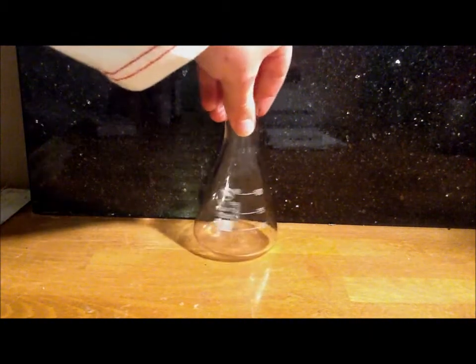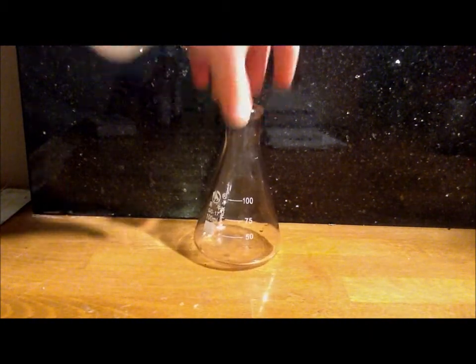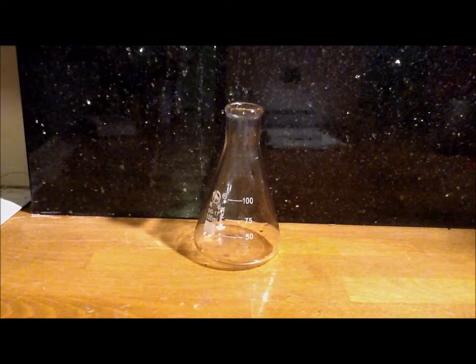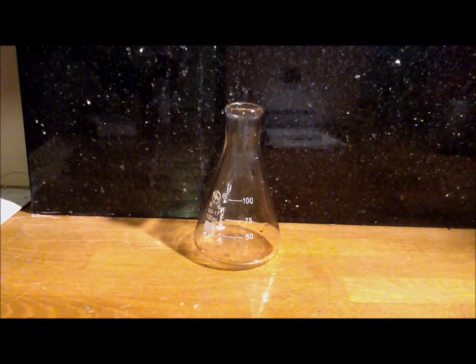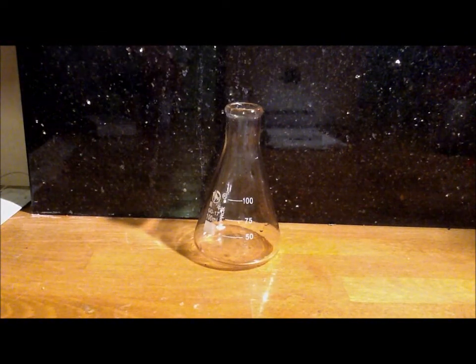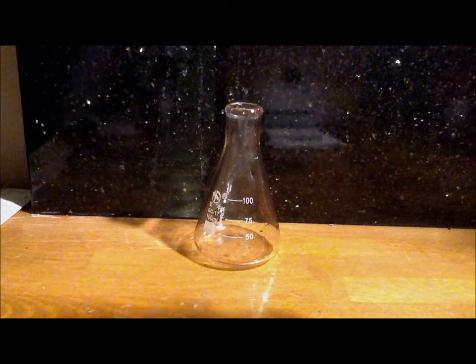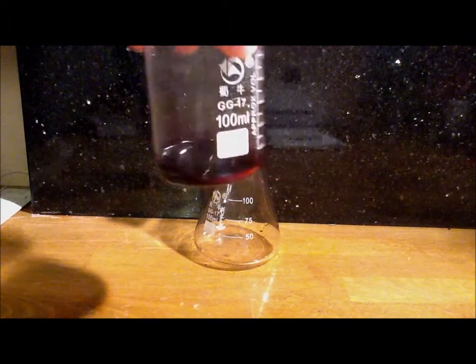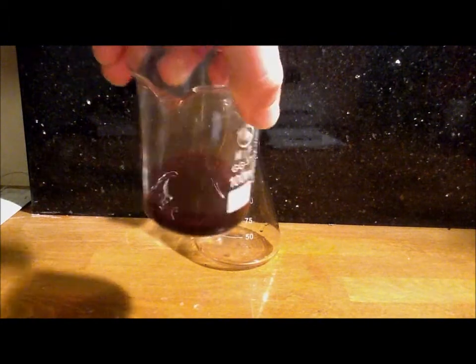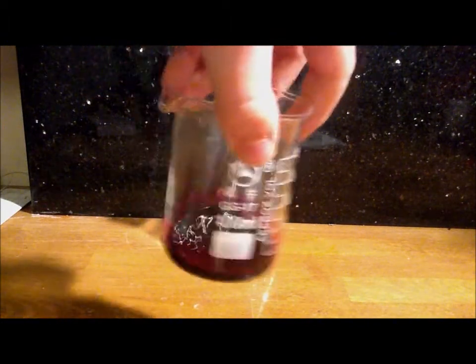Okay, time for the reaction itself. You need to get your conical flask and then you need to put your potassium permanganate in. You need to make a solution of it first.